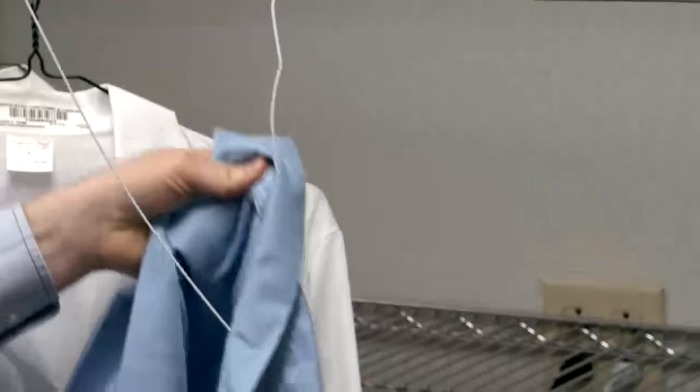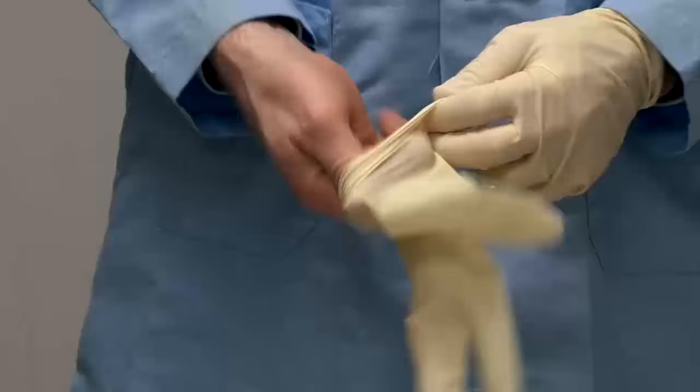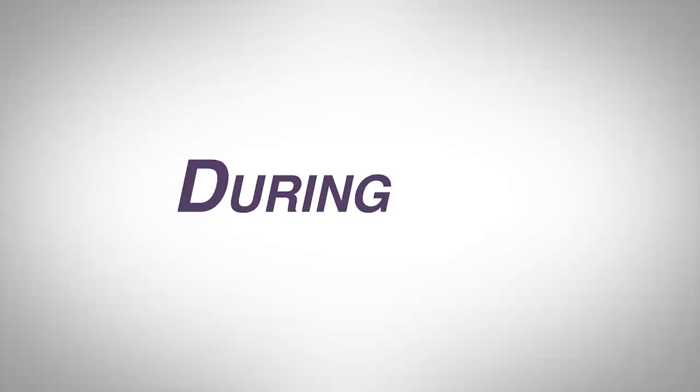Always wear the provided Personal Protective Equipment, or PPE. This may include a lab coat, safety goggles, and gloves. Also, wear closed-toed shoes. Tie back long hair to prevent catching on fire or contaminating your bacterial cultures.